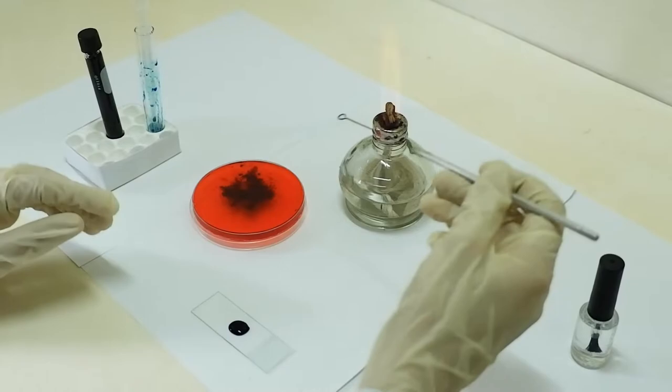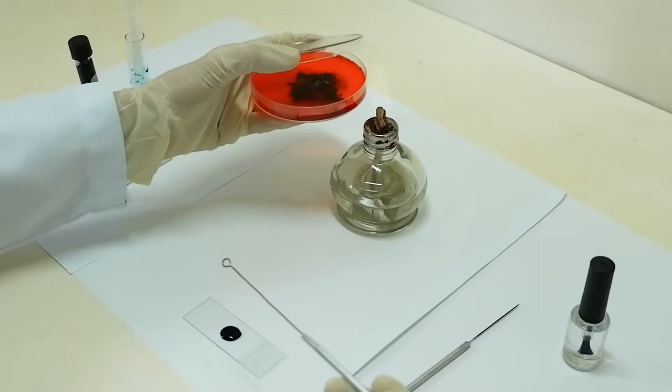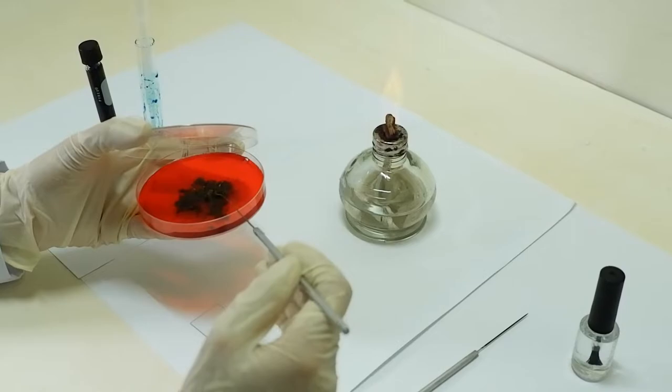With a flamed and cooled stiff wire inoculating needle, pick up a small portion of your fungal colony, cutting through the aerial and vegetative mycelium. Take note that you must not take the center or the edge of the colony.